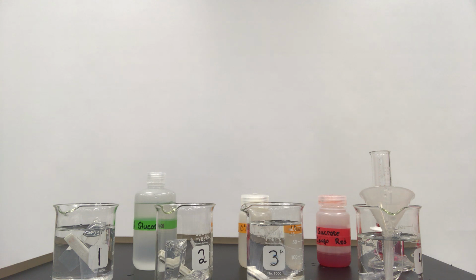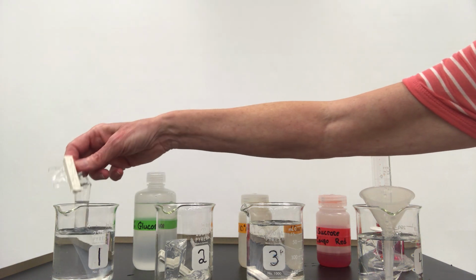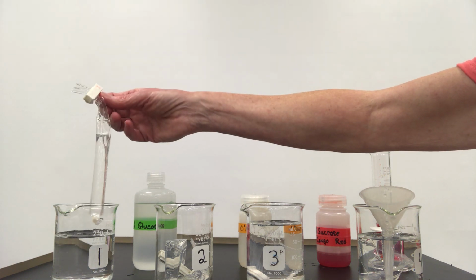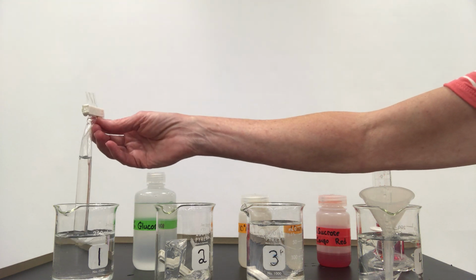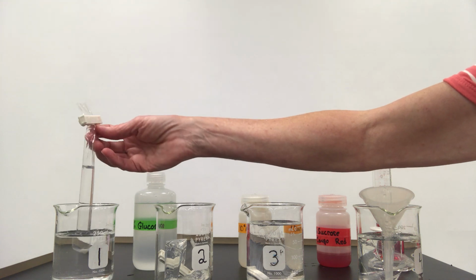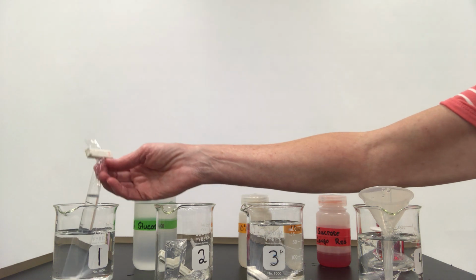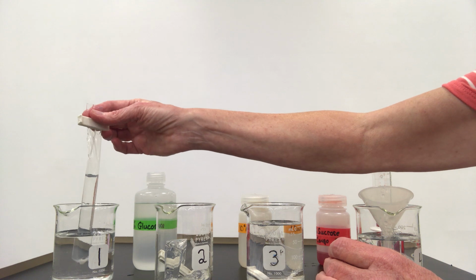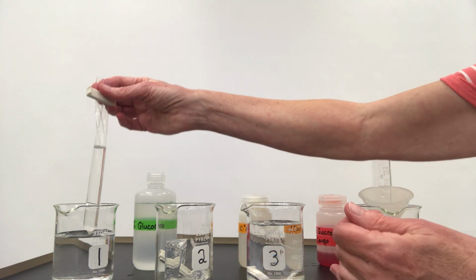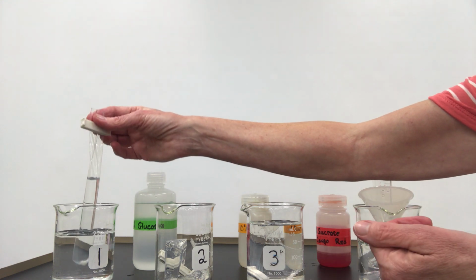The 4 different beakers are going to have different solutions. The first beaker, which has already been set up, has the dialysis tubing filled with glucose. Glucose is a monosaccharide, and we have placed that glucose-filled sac into a beaker full of distilled water. So we are placing it into a hypotonic solution. Once we had filled it, we weighed it initially, and at the end of the lab, we will weigh it again to see if it has gained or lost any weight.